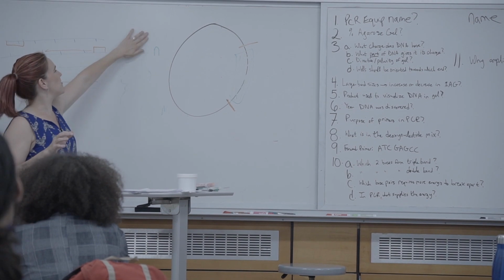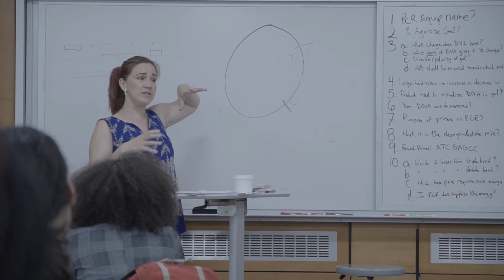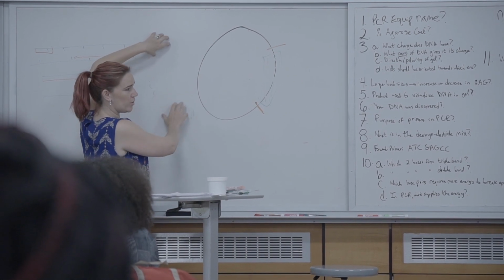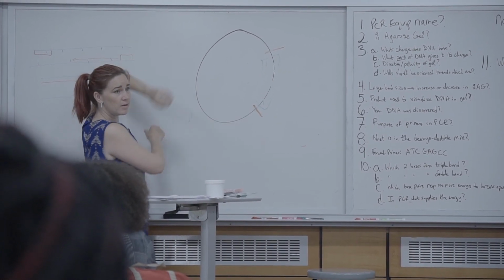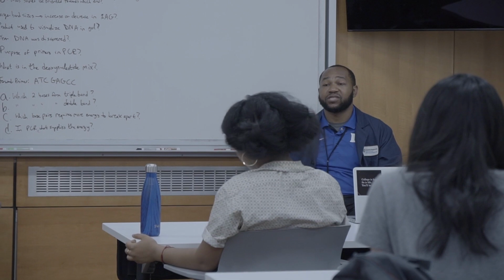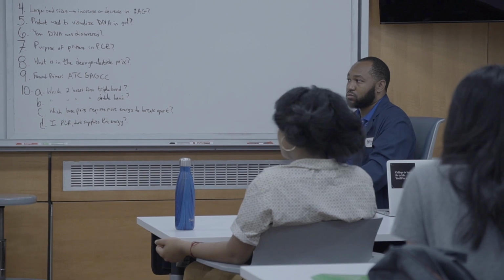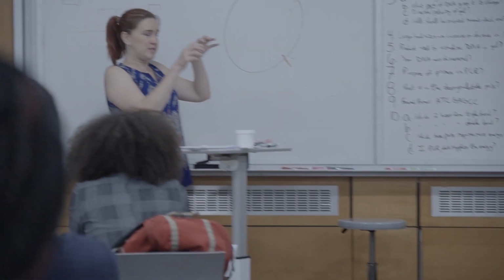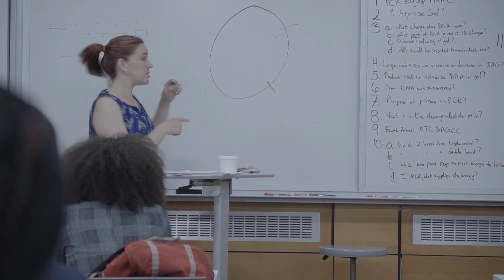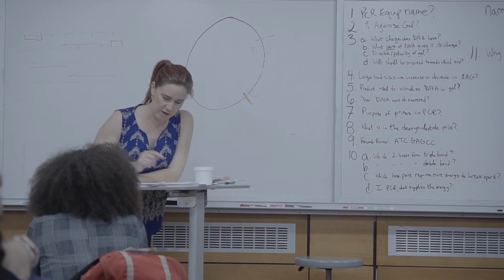So our pore size is going to be bigger, right? So then our big piece of DNA will be able to get through a little bit faster, and we'll get better separation up high. So if we made a 1% gel today instead of a 2%, those same bands would have drifted further in the same amount of time. The opposite, if we have really small bands we're trying to separate, we want to increase it, because we want the really small stuff to have a harder time, so we get a bigger separation. That's why the ladder is so important, because the ladder will move around depending on how big your pore size is. Great, excellent.